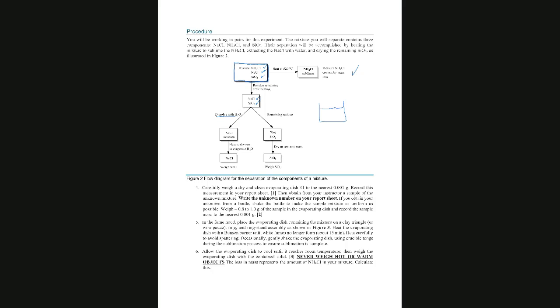Actually, you won't have a beaker. Let me correct myself. You will do this in an evaporation dish. So you will have something like that.